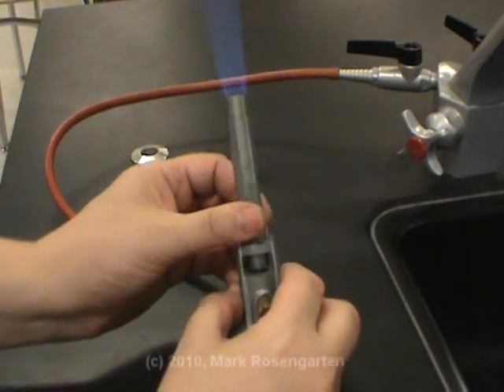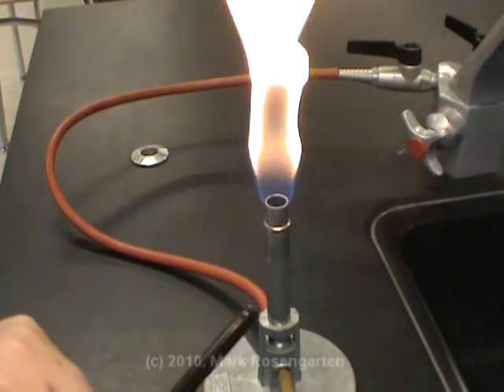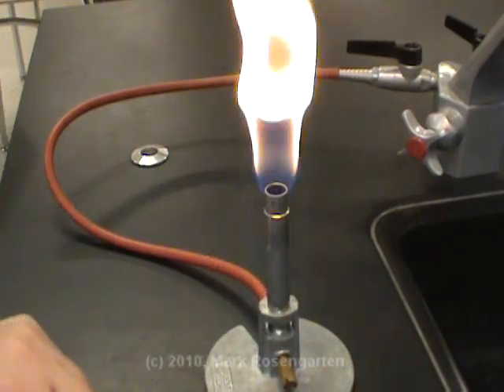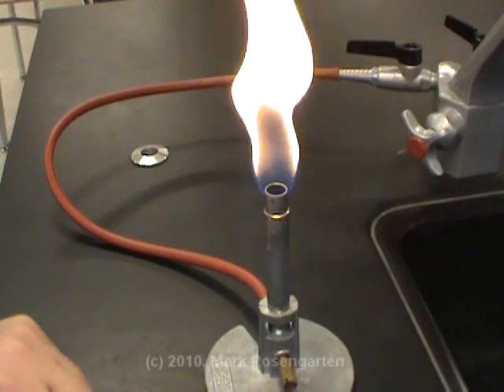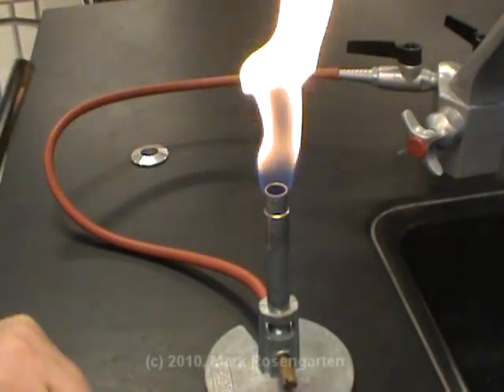Now if we close the air hole down all the way, we get what's called the luminous flame. This is because there's no air being let in here for the gas to burn. So you just have pure gas shooting up here and it's not meeting oxygen until it gets into the outside environment. And so it doesn't mix completely with it, it doesn't burn completely. It burns incompletely and gives off soot, basically tiny particles of carbon.